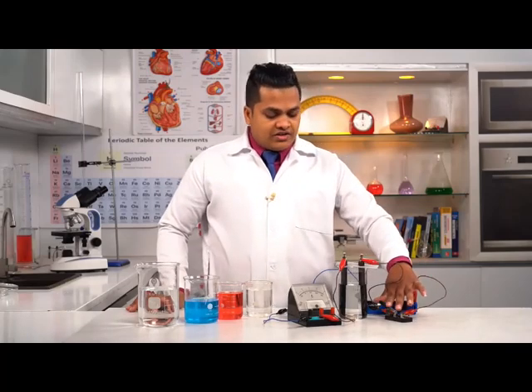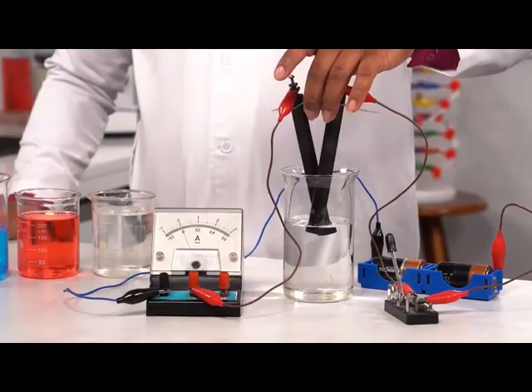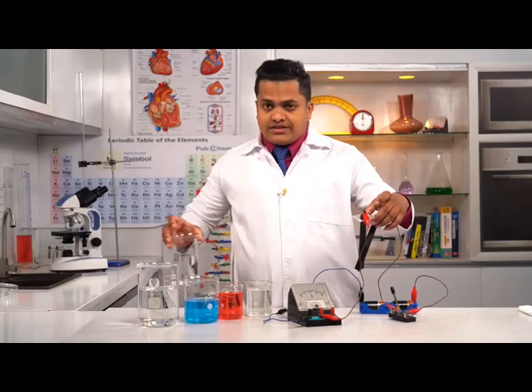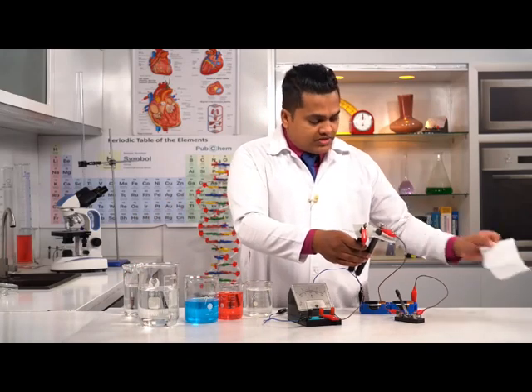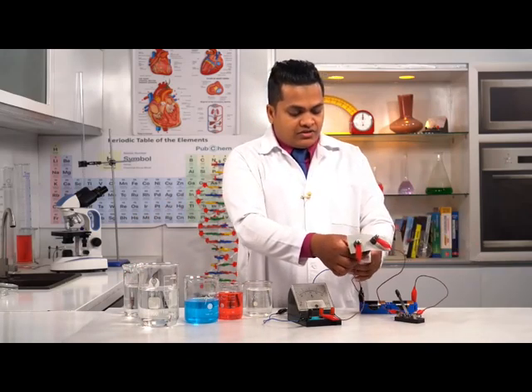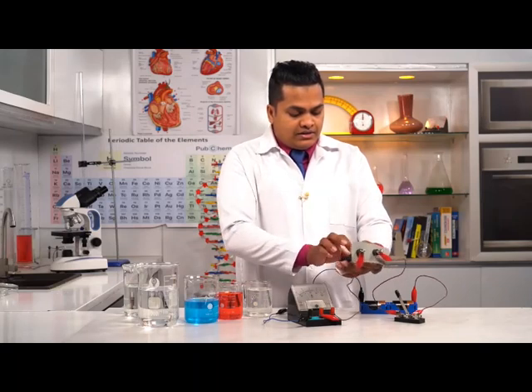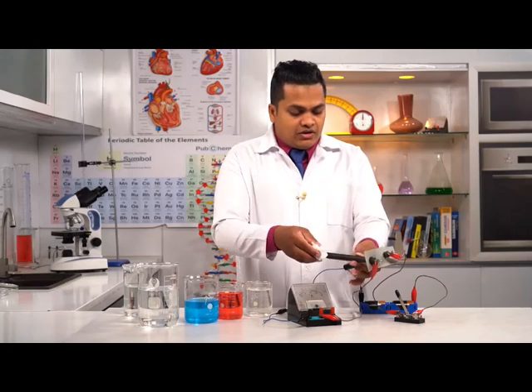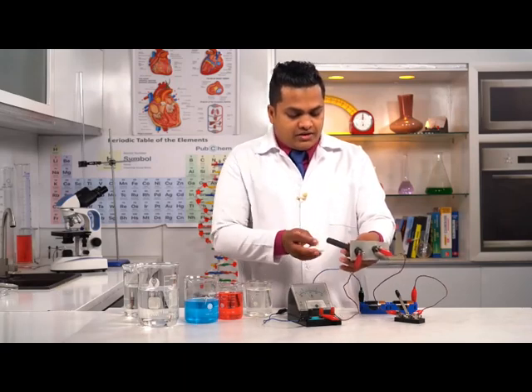Right. So now let's turn off the switch. We'll remove this system. Right, my dear children, now when I'm going to insert these two electrodes into the next solution, it's important to at least wash them, or else you can use a tissue paper and clean the areas that had the previous solution, like this. So it's better to clean it like this. Then after, we are going to insert the system into the second one.